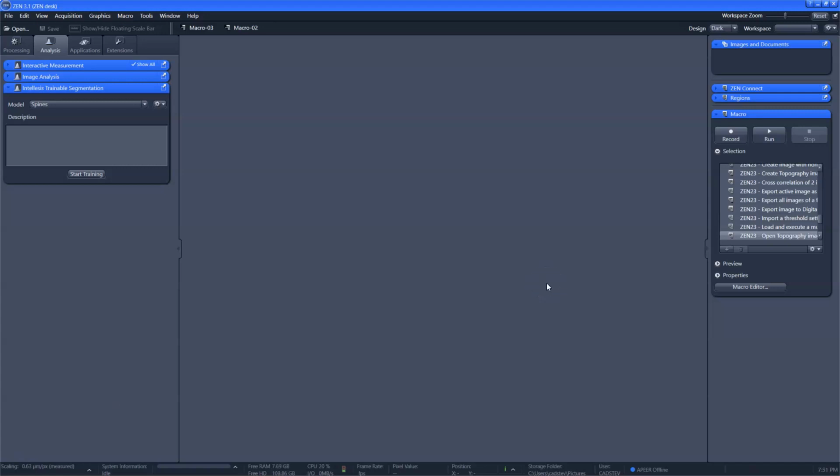It is important to note once again that the pixel classification rule set we have created is not going to provide us with data. Instead, the output is simply a mask of our image that identifies objects of interest. This can be very useful in image analysis, where we will obtain our data. But first, let's take a quick tangent from our analysis to better visualize the results.